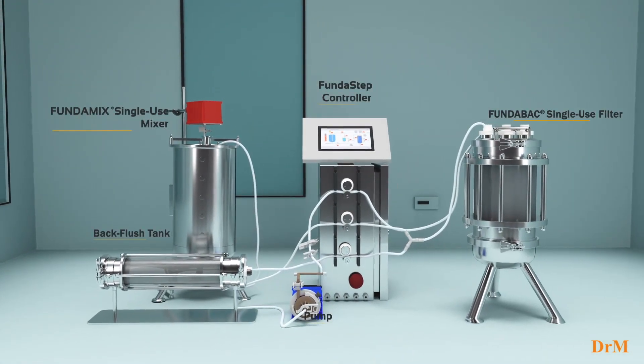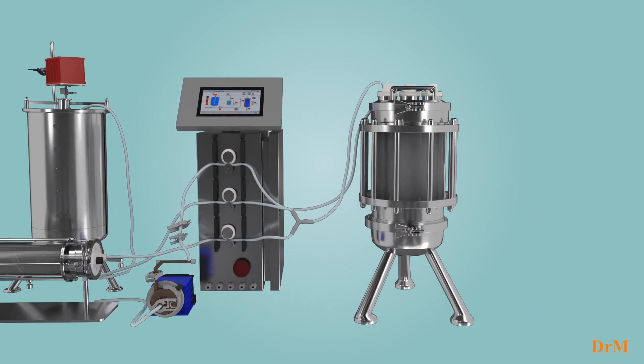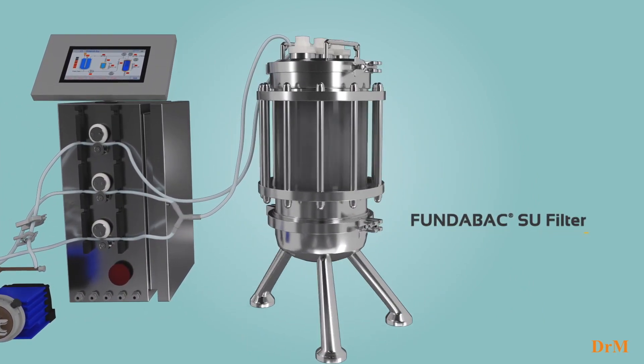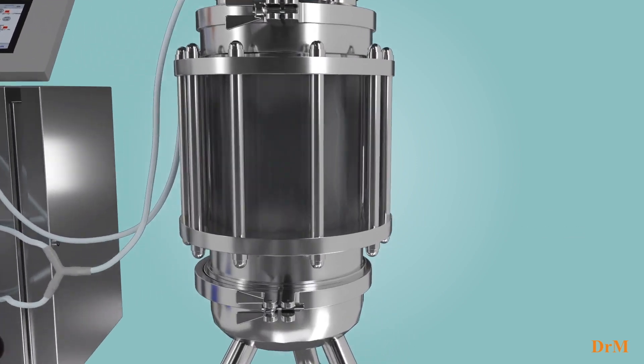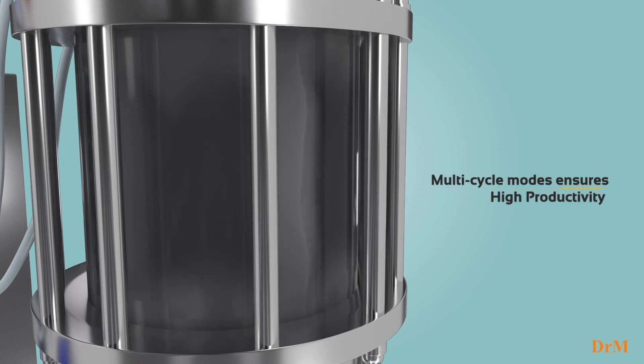Let's have a detailed look at the process and the specific advantages of the key components. The Fundaback SU filter consists of large surface filter elements packed into a fully contained plastic enclosure. The filter offers high productivity as a result of its multi-cycle filtration mode.